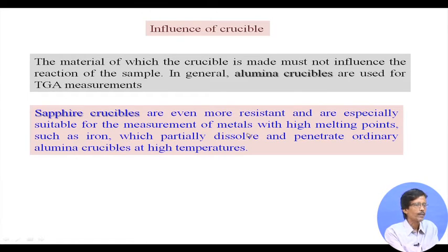So, when we go for metals, particularly the metallurgists, the metallurgical engineering people, they see ceramic formation and alloy formation, handling all these metals and heating them at around 1000 degrees centigrade. But we are chemists, and we mostly do reactions starting from room temperature to boiling water temperature, to boiling solvent temperature. Sometimes we can also do some solid state reaction on a sand bath, or in a muffle furnace which gives you a temperature of 600 to 700 degrees centigrade.